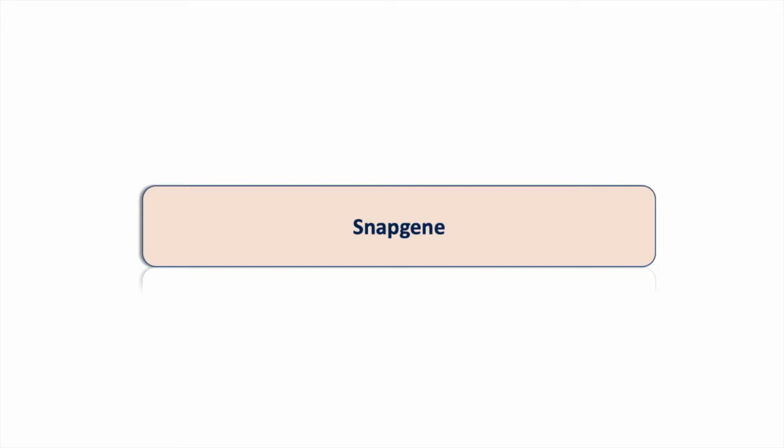I just bought this program for myself because I find it particularly useful in the projects I'm doing, especially in designing my cloning reactions and designing my PCRs. Of course, I use it also to view and edit DNA.